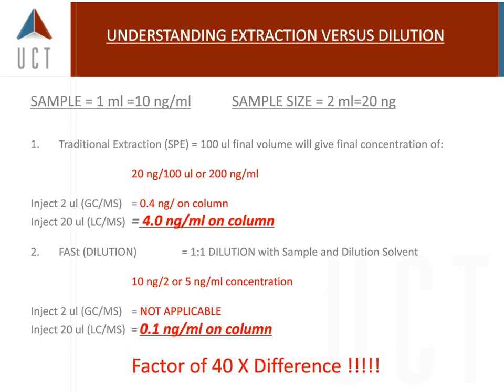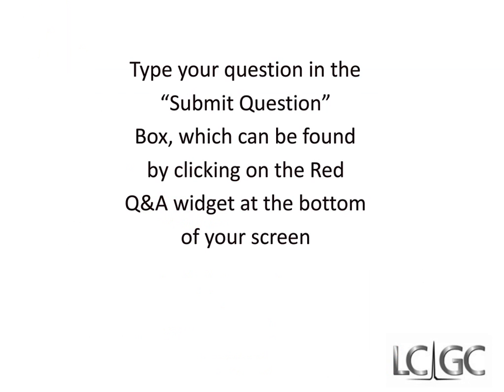No. And here's why. Because once you start introducing buffers like phosphate buffers, remember at the Q0 of your mass spec, it's very hot. You're getting rid of all that solvent. You don't want to be putting phosphates on the front end. You'll get dramatic suppression of your signal.